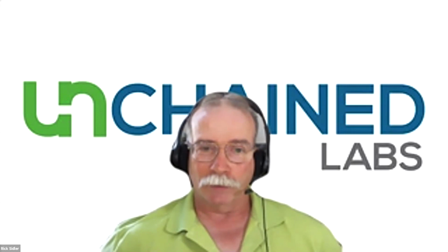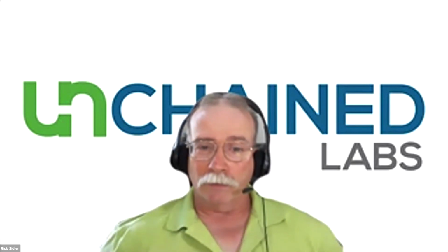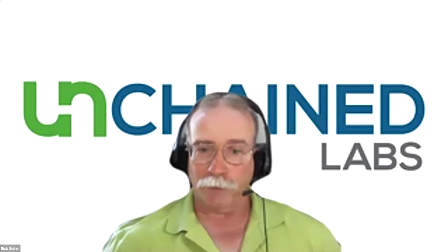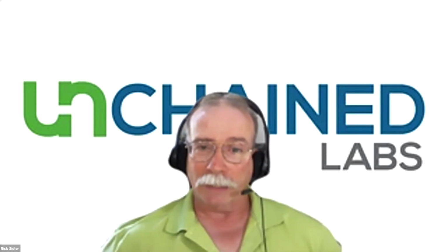Yeah, most laboratories have someone who's a super user of the systems, just so they have a consistent person in the laboratory who can help train others, help facilitate use of the instrument there. A lot of the smaller junior platforms are really walk-up friendly to do things like powder dispensing or reaction screening, so a minimal amount of training to create a design, and users are able to come in and run those workflows. Some of the larger, more complex workflows where we might actually connect multiple big kahuna platforms together tend to be a lot more complicated to run, and those benefit more from having dedicated users or super users, at least to help facilitate the utility of them.